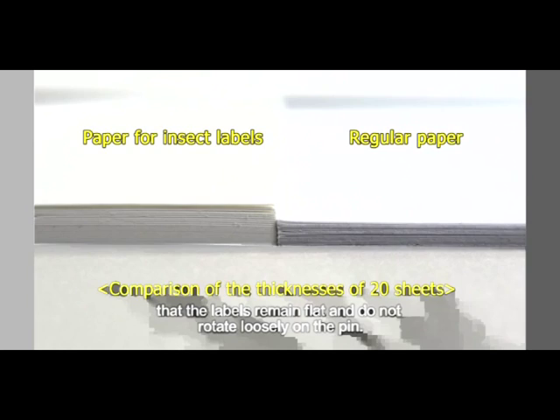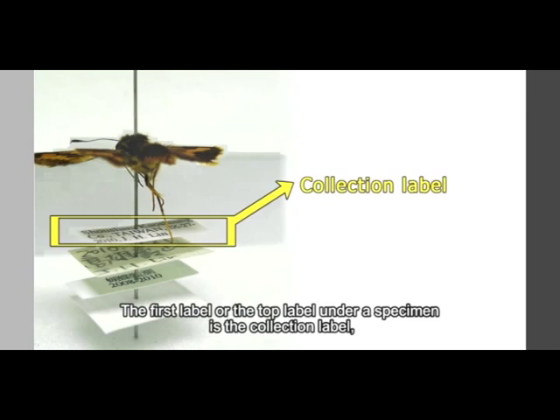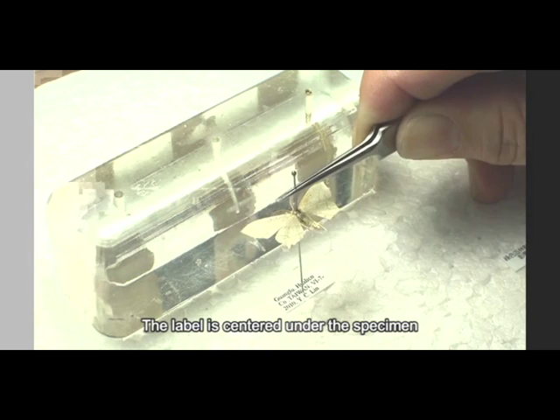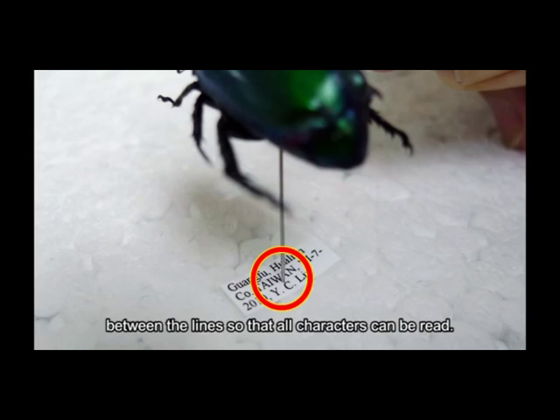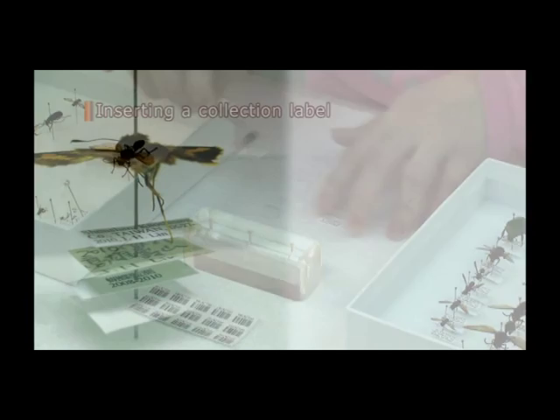The next step is to label the dried specimen. The paper used for making labels should be heavy enough that the labels remain flat and do not rotate loosely on the pin. Labels must be printed in high-grade ink that will not fade over time, and the information on the label should be clear and easy to read. The first label, or top label under a specimen, is the collection label and should contain basic information such as the locality and date of collection, and the collector. The label is centered under the specimen, and the insect pin should go through the spaces between the lines so all characters can be read. Position the collection label on the middle step of the pinning block so that all collection labels are at a uniform height on the pins.